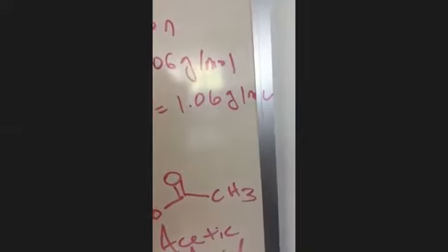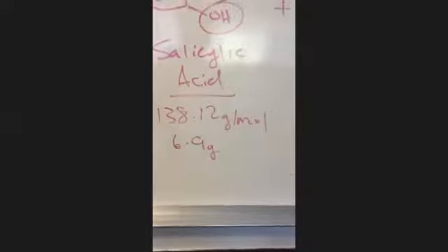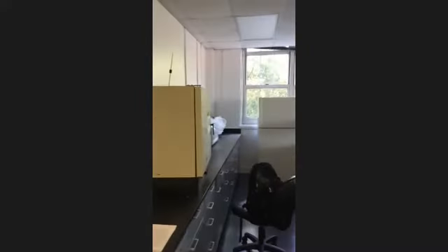And then for the actual amount for salicylic acid, that was calculated, like. What group are you in? Group 3. Who is here from group 3? Anybody? You don't have a group representative here? So use 6.91 as your actual amount. And then do the same for sulfuric acid.